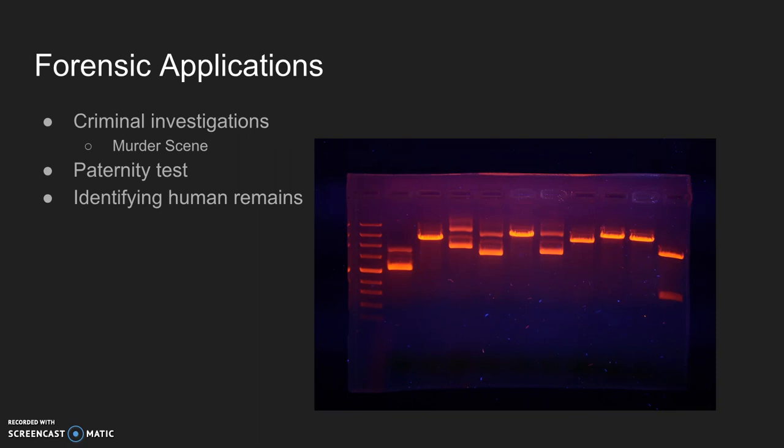It is important to recognize that this image was taken under UV light, and this is because a fluorescent tag known as ethidium bromide was mixed into the agarose gel solution before it cooled. As we learned in chemistry, different molecules have different absorption maxima, and ethidium bromide absorbs wavelengths of 210 nanometers all the way to 285 nanometers, which corresponds to ultraviolet light or UV light.